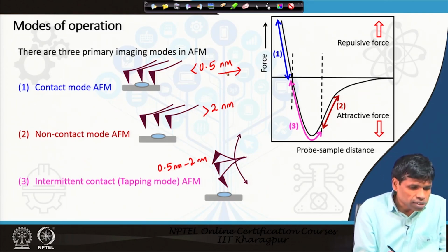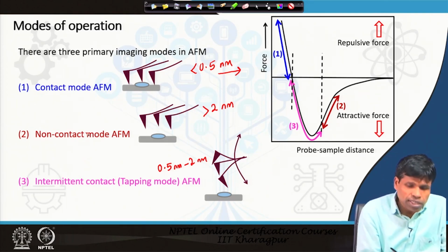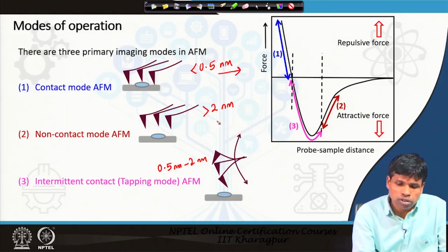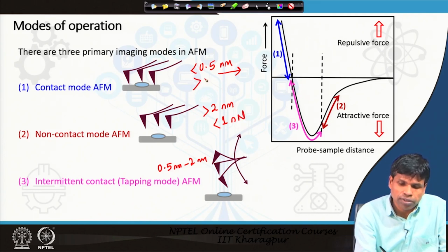And in the case of the non-contact mode, certainly the force will be less. The force will be less than 1 nanonewton, whereas in contact mode it is greater than 1 nanonewton.